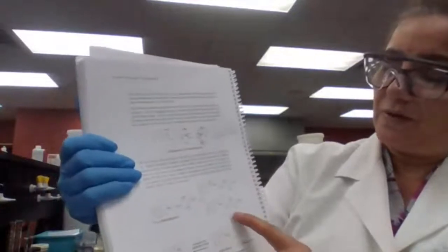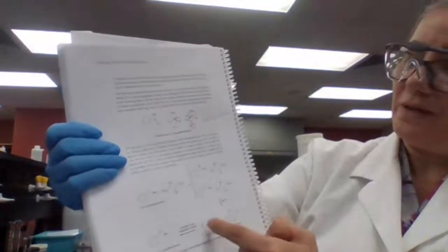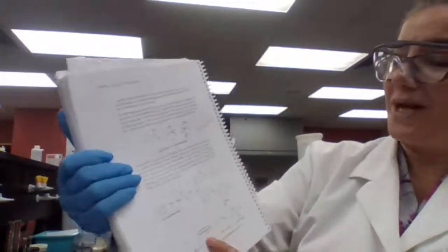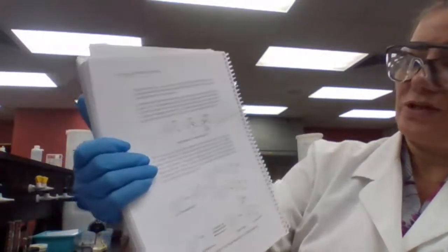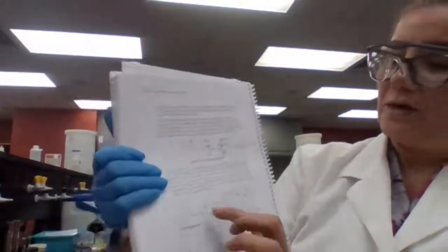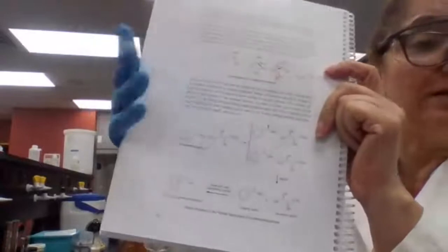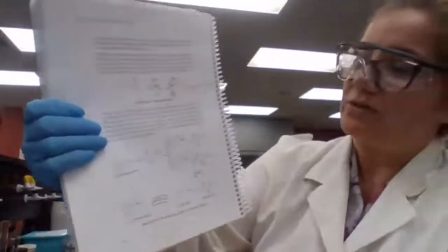So what we do, after adding sodium hydroxide, we are going to separate the bond between the amine and the tartaric acid, because we want only the amine, and then we can extract that. We just get the final product, a pure sample. So the technique is called resolution. I didn't cover that in lecture because that's kind of elective for the lecture, but we cover that in the lab, and every lab does this type of experiment with the enantiomers and doing resolution.